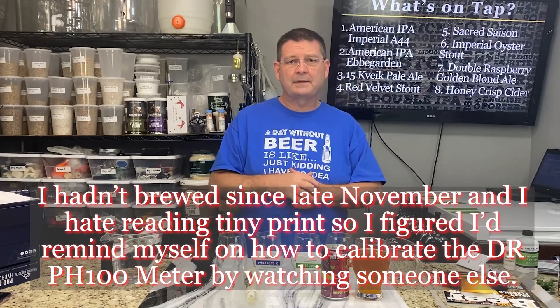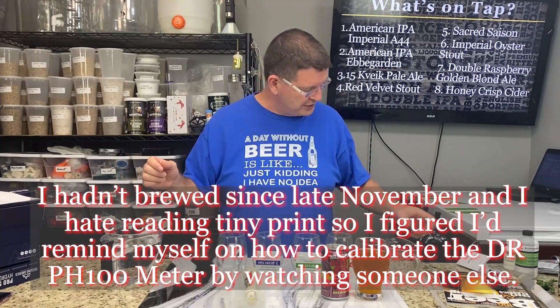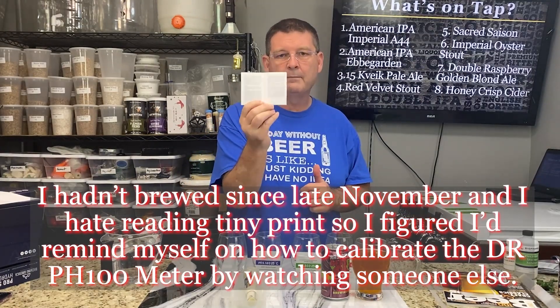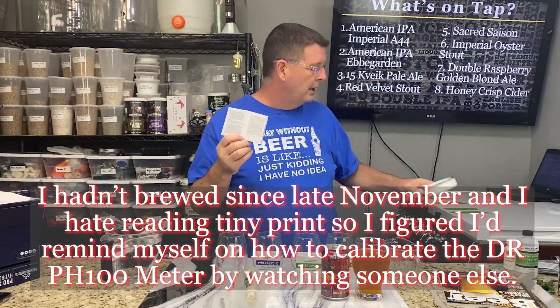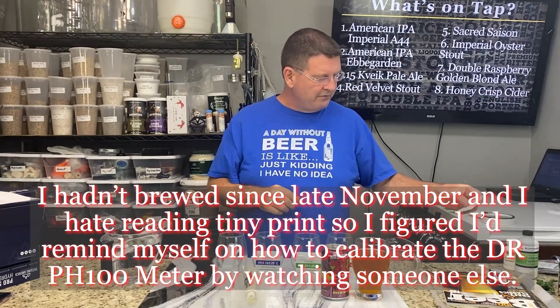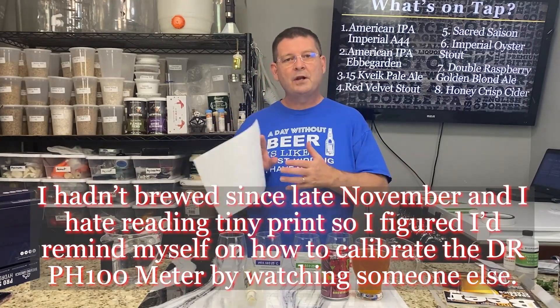What irritated me was that I calibrated this thing before without really thinking much of it. The instructions are microscopic — I literally need a magnifying glass to read them. I was watching a YouTube video about it and thought the guy seemed to know what he was talking about, so I wrote it down and did it his way.